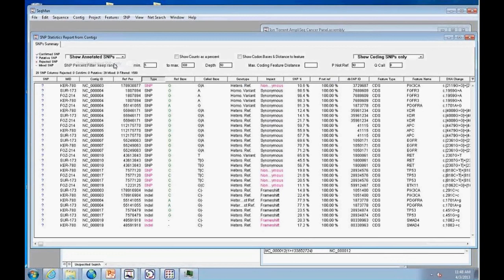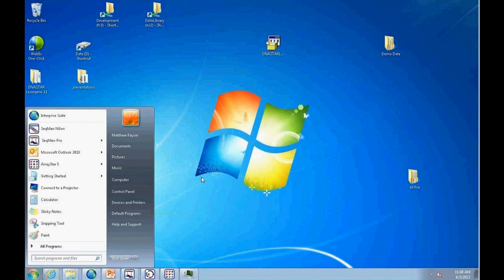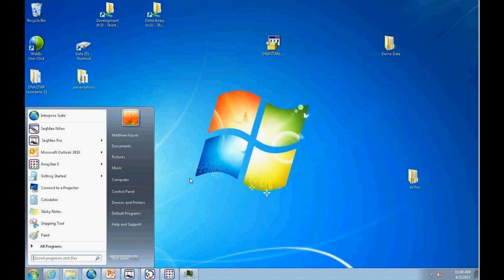Applying filters — minimum occurrence 5%, maximum 100%, depth of 50 in this deep assembly, and coding SNPs only — narrows results to coding change variants. In SeekMan Pro you can verify SNPs by looking at the assembly at those areas. To compare across samples, for instance finding SNPs unique to one sample or common to all, or comparing control versus experimental, ArrayStar offers more advanced multi-sample comparison capabilities.